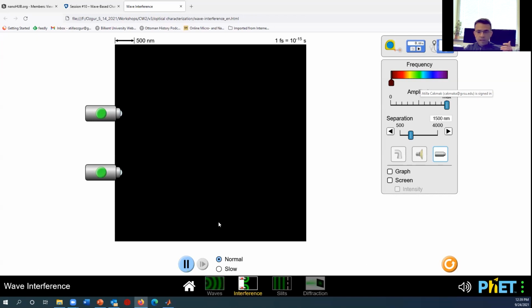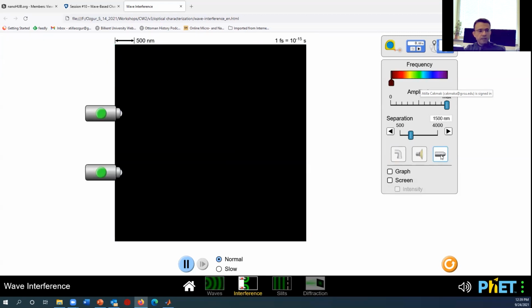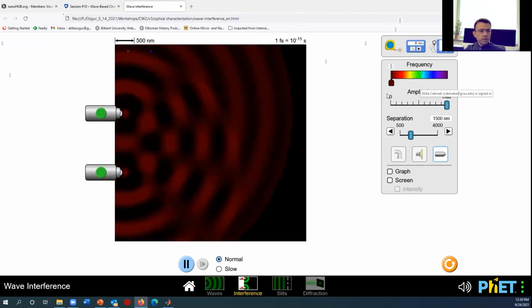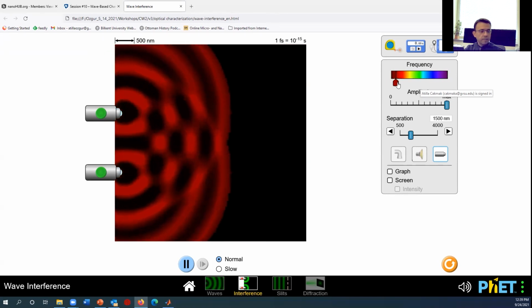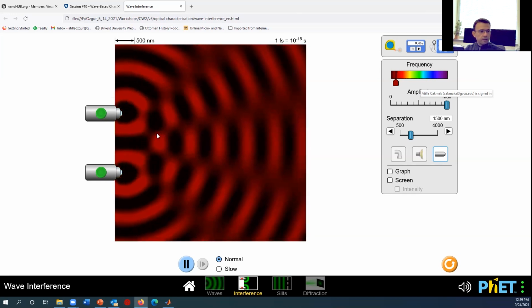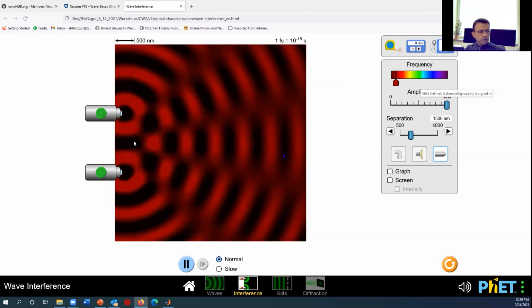We'll see about it. It's starting with a wave interference phenomenon, and the basic is like you can start from the water tap or with the lasers. So you just turn on the lasers, as you can hopefully see. It's a bit dark, I know. We're sending, let's say, in the infrared or the red wavelength, okay? And we see immediately the interference patterns emerging, right? This is what we call the diffraction patterns.